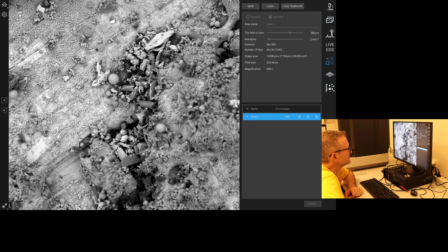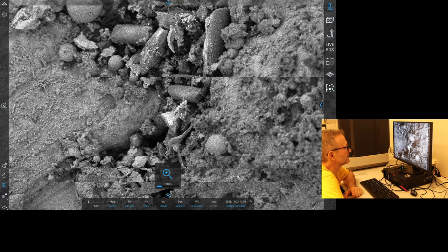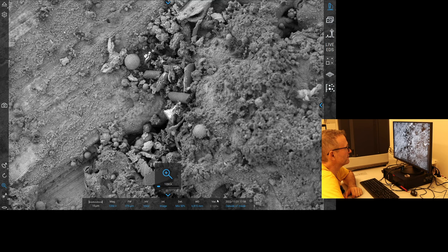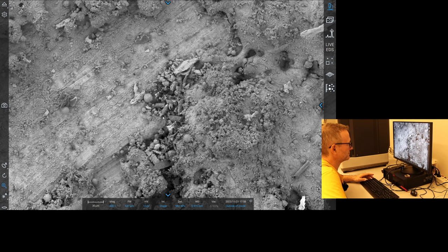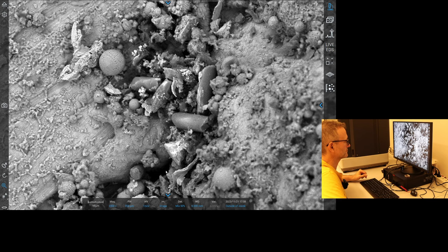This is interesting. This looks like an agglomeration of balls, and we have our silicon carbon bits in there. Let's go here. Bang on the silicon chunk. I really should change that to 10 to 15 if we're going to do some analysis. You can't see the heavier elements if you don't have it up at 15. Okay. This is a more smooth sphere.